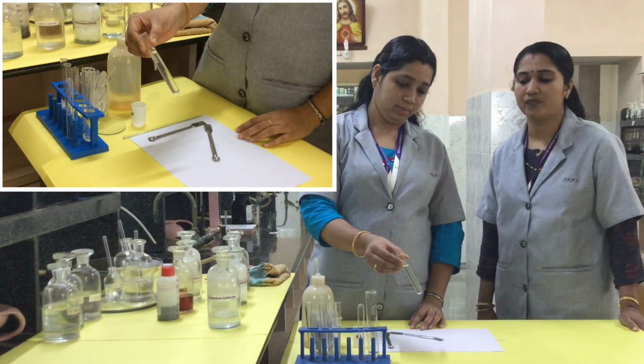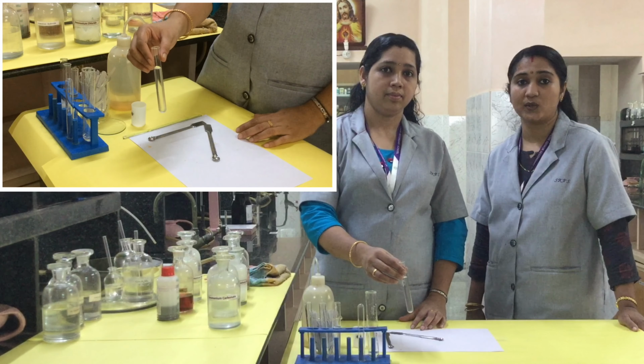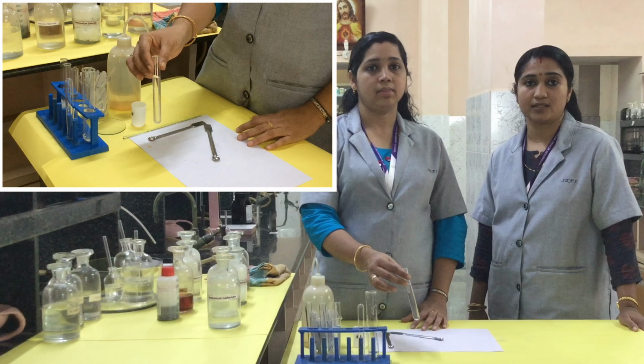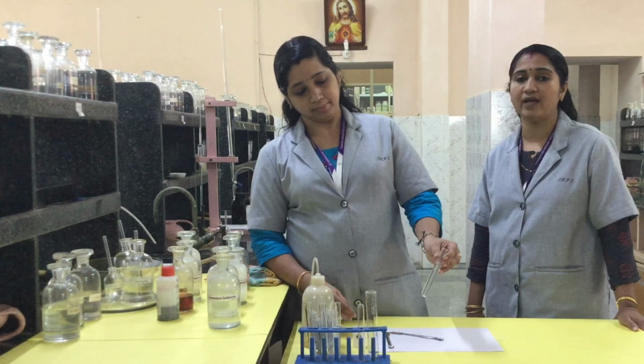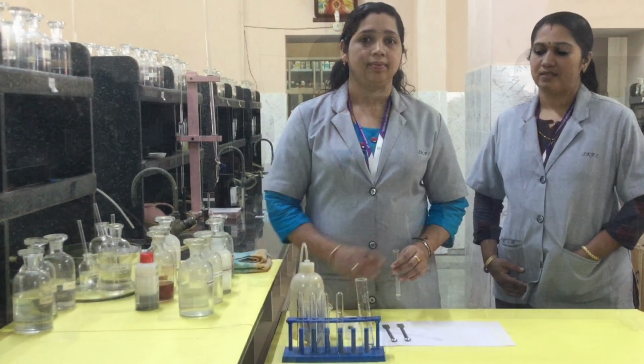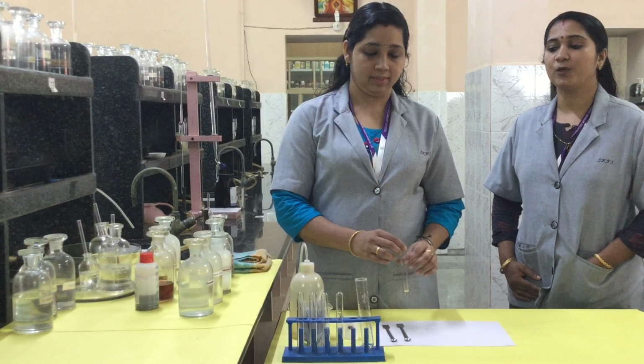The group reagents that we use here are solid ammonium chloride, excess of ammonium hydroxide, then ammonium carbonate. We analyzed group 5, which contains barium. So group 5 is absent. Next is the analysis of group 6.